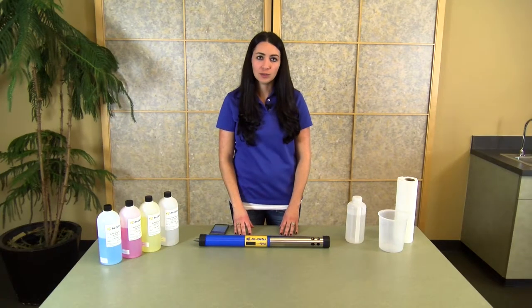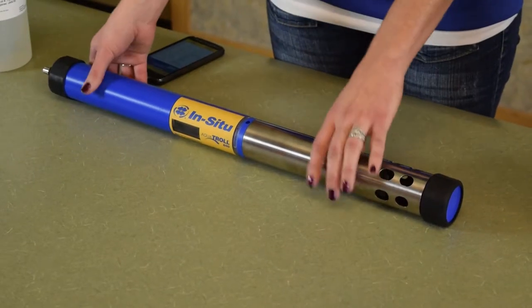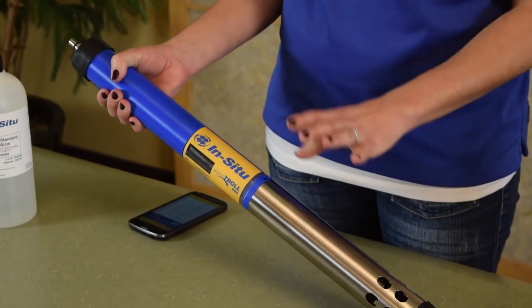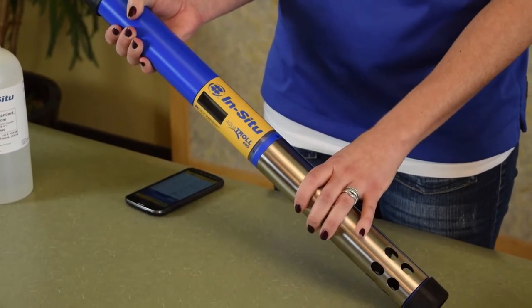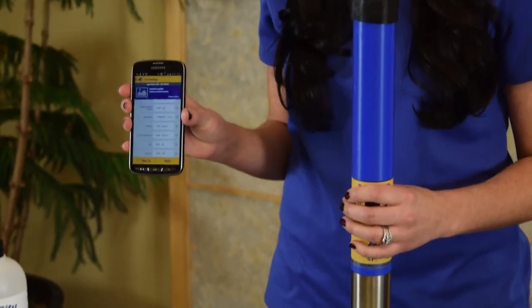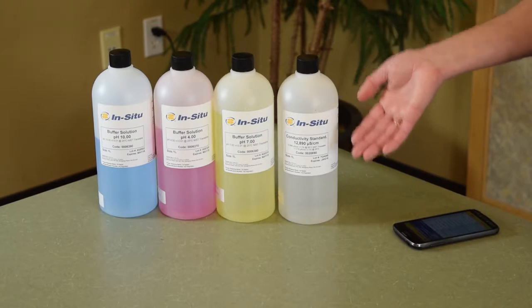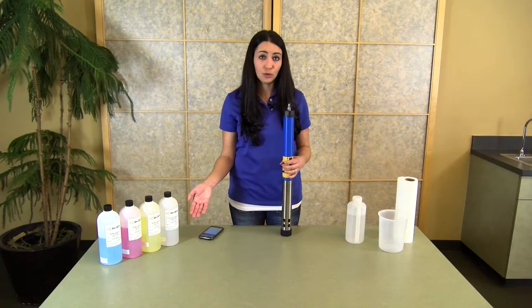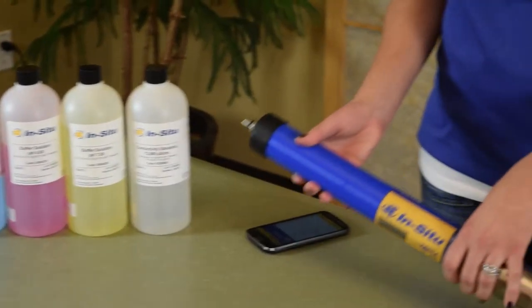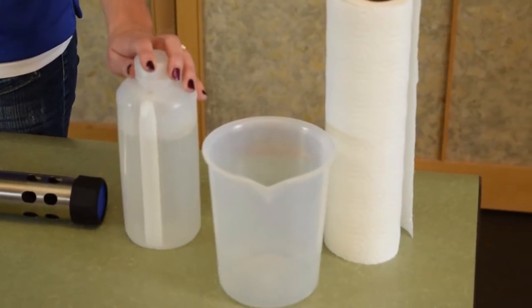Prior to beginning your calibration, whether you're in the lab or in the field, there are a few things you need to make sure you have. You want to have your instrument as well as the bottom part of the restrictor used for your deployment, your communication device or laptop computer, and whatever calibration solutions are required by your standard operating procedure. Lastly, make sure you have a rinse bucket as well as some deionized water or fresh water.